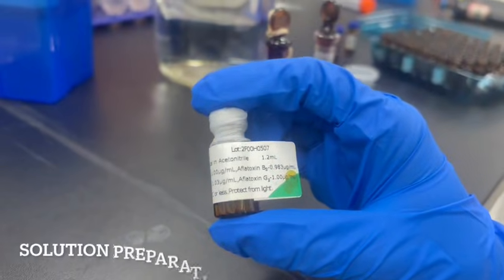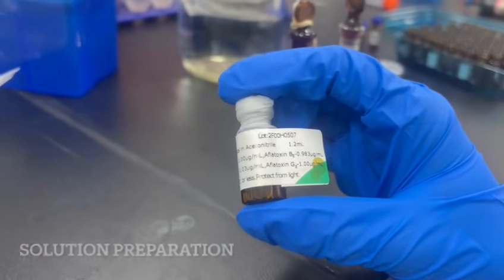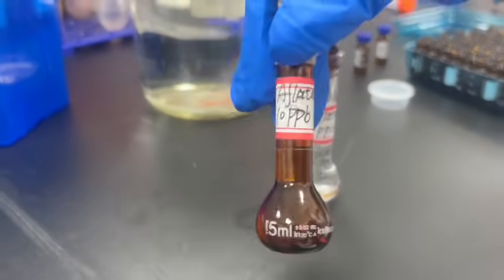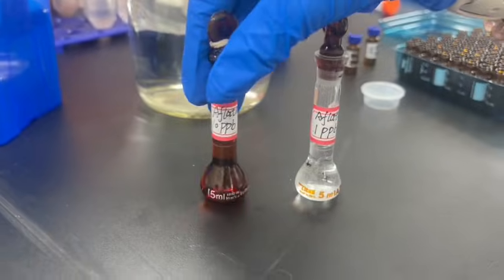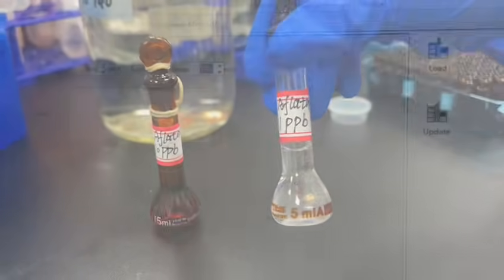Hello, Migo. Here you can see an aflatoxin standard with a concentration of 1000 ppb, and here are the two solutions. One is 10 ppb, and at the last, we will use the 1 ppb for injection.